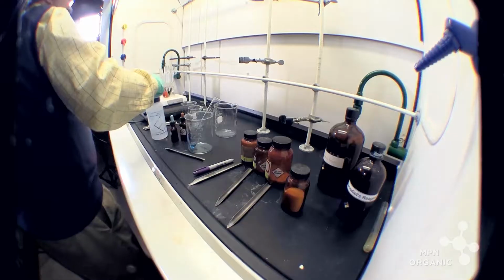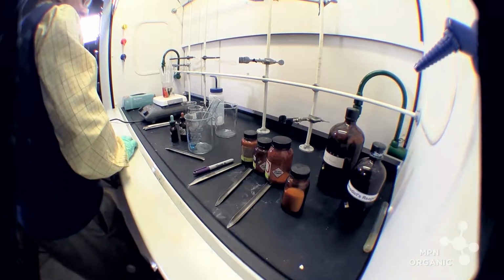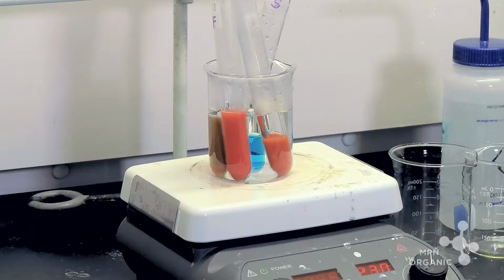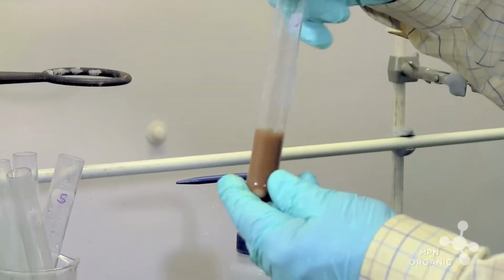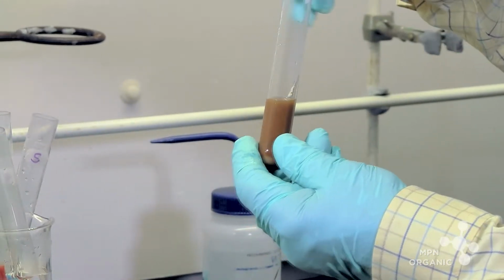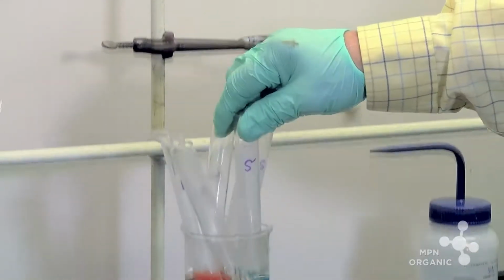Let's let that go for a minute, and then I'll put the sucrose with the Benedict solution and see how that works. Well, see, the lactose is starting now to very clearly indicate that it's reducing the copper 2+ blue ion to the copper 1 oxide, which is a reduction. And still, the sucrose resists change.